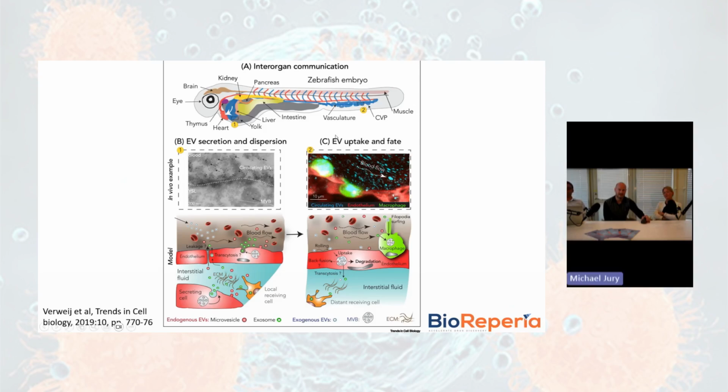The zebrafish larvae is transparent, so you can actually take video recordings of how the EVs are flowing around and being taken up by cells. I will show some examples of this.